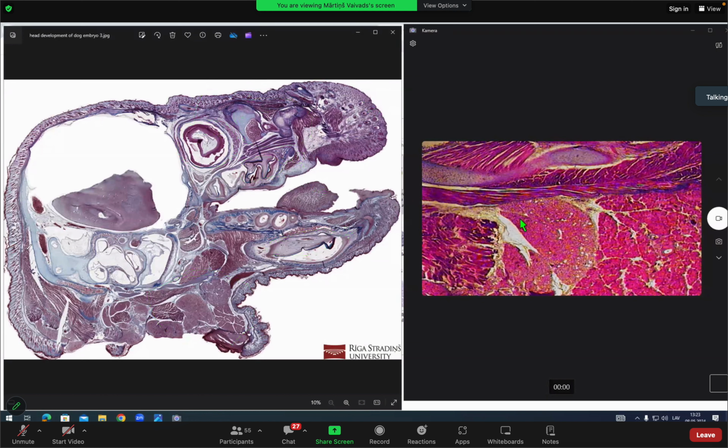So we will need to talk about glands. So there's multiple glands here. Here, I will encircle this one with number 8. That's developing sublingual gland. Then below with number 9, developing submandibular gland.